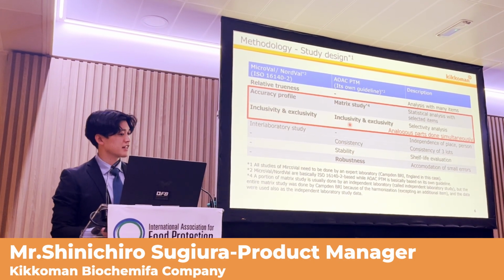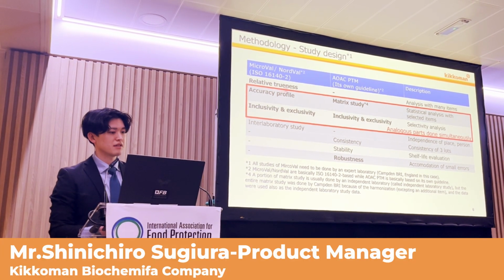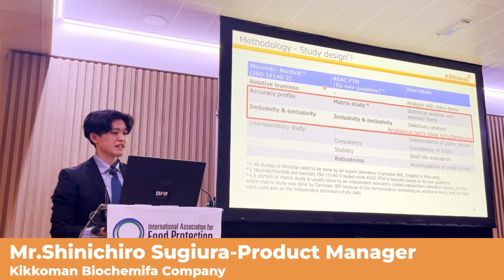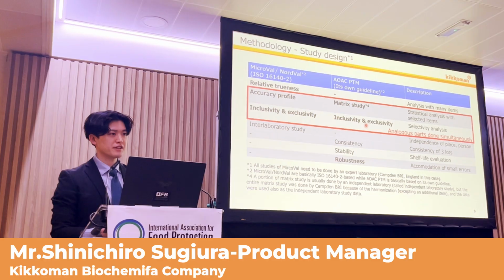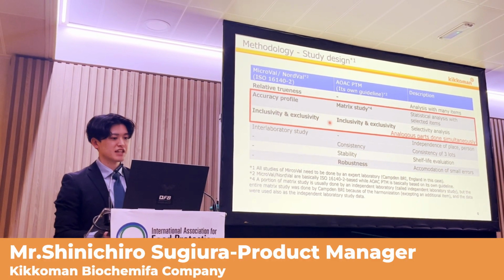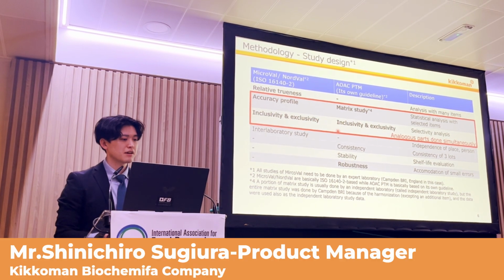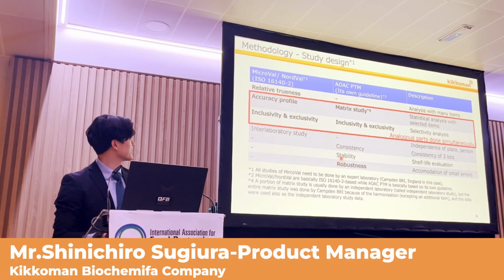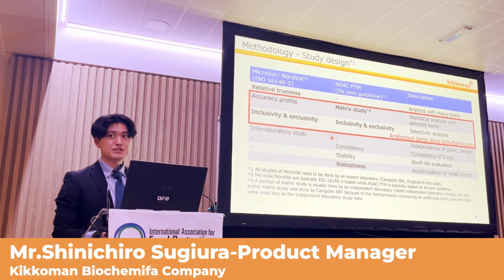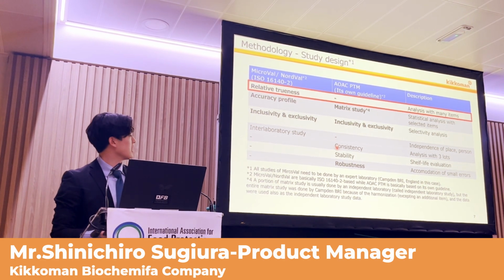And this is the study design, and MicroVal consists of 4 studies, and AOAC consists of 5 studies. And since 2 of them are analogous in each validation scheme, they were done at the same time. And I cannot cover all of them today because of time limitation, but I will cover the studies which were written in bold. So the first one is relative trueness.